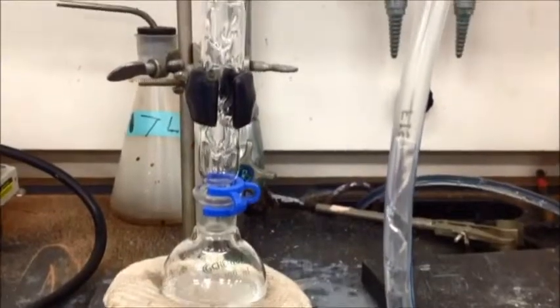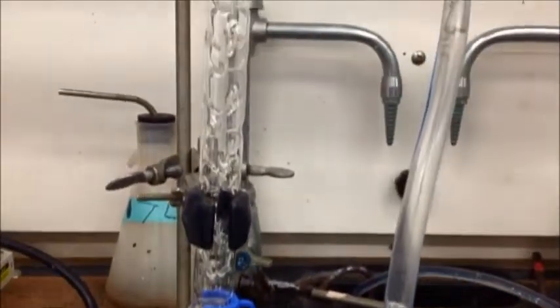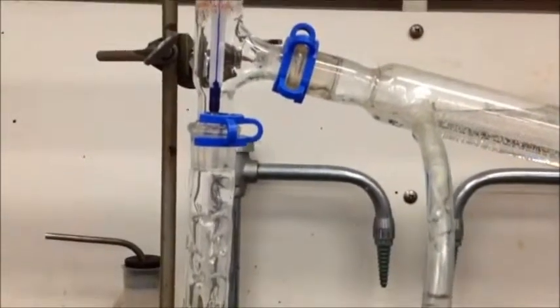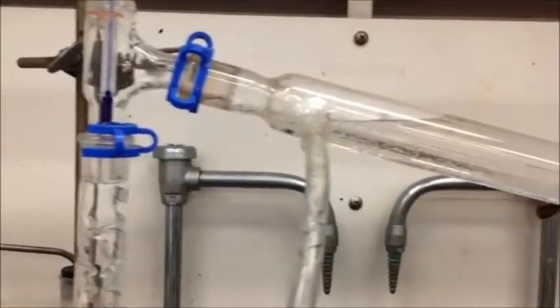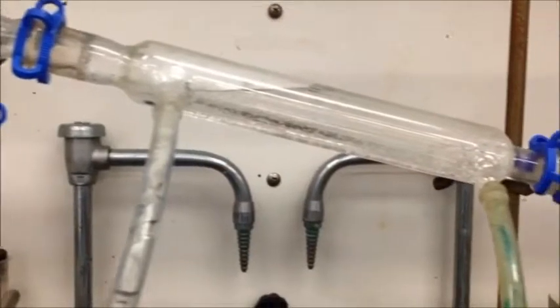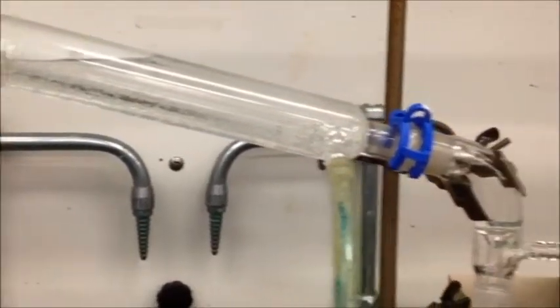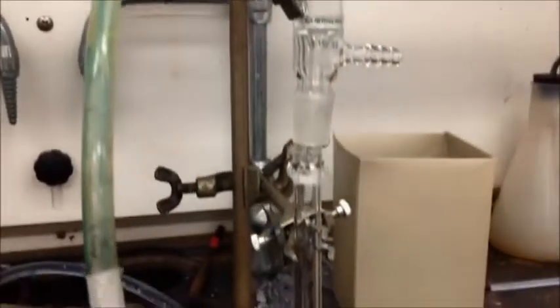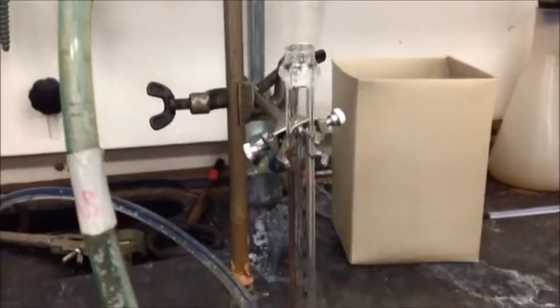Once your liquid has vaporized and moved through the distillation column, it's going to pass through the condenser. The condenser is a long glass tube insulated by another glass tube. The reason for this is that cool water will be passing through the two walls of glass, while your vapor moves through the middle. This will cause the vaporized liquid to recondense so that it can be collected in your graduated cylinder.